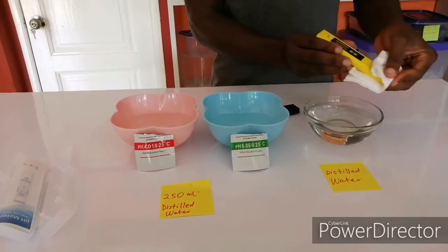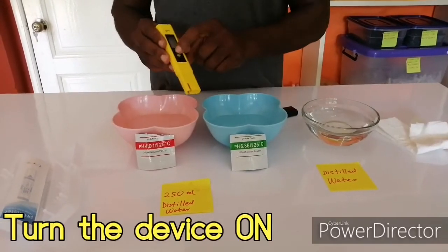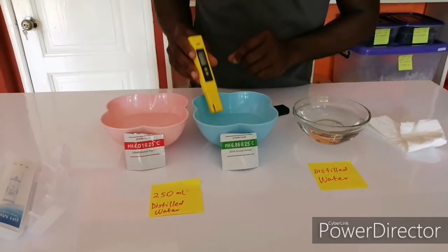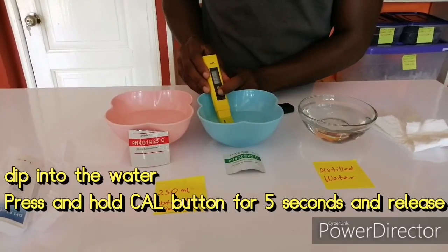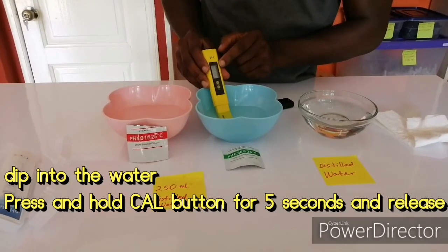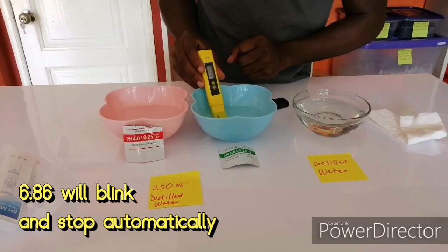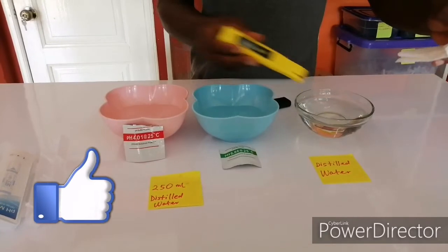You clean with your clean cloth, and then turn it on. Dip it in, then press and hold the CAL button for 5 seconds. Release. You see 6.86 blinking — you leave it to stop blinking. That means it has calibrated. You rinse and clean.